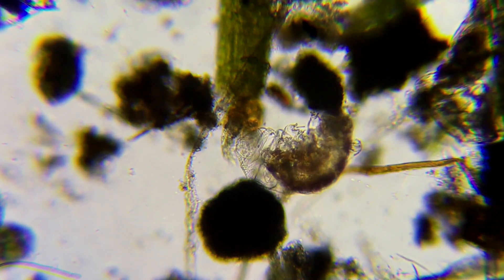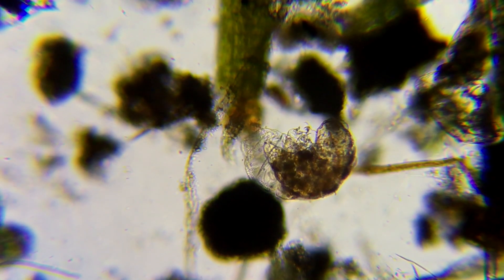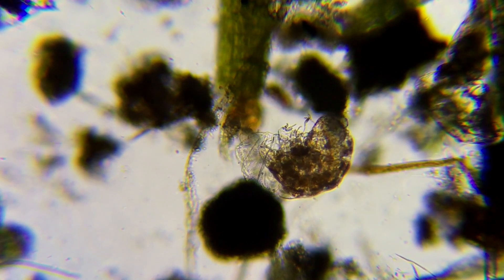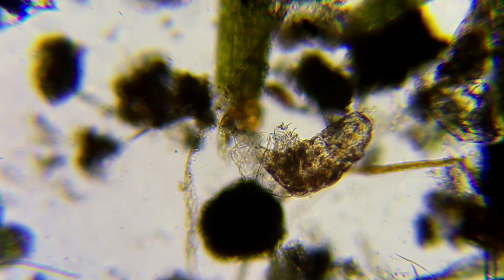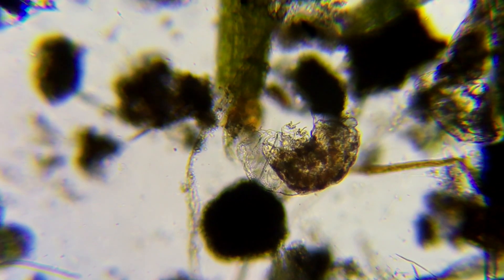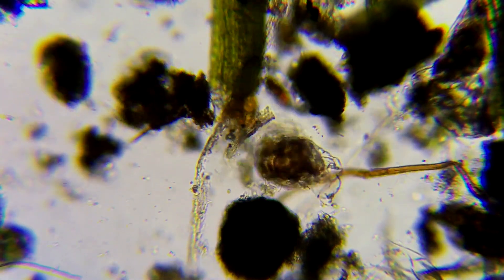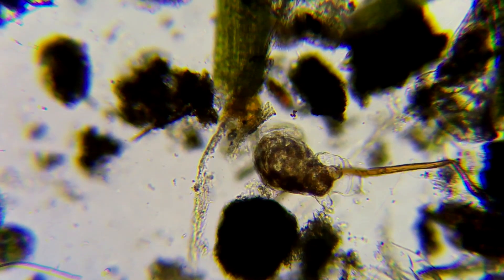It's cute that you can see its little legs, and we failed a bunch of times at this. So here we have our tardigrades shedding. It's not that fast — we watched it for 15 minutes and it didn't get out of its skin, so this is a time-lapse of it trying to get out of its skin.